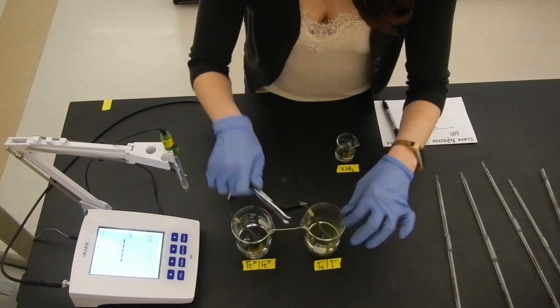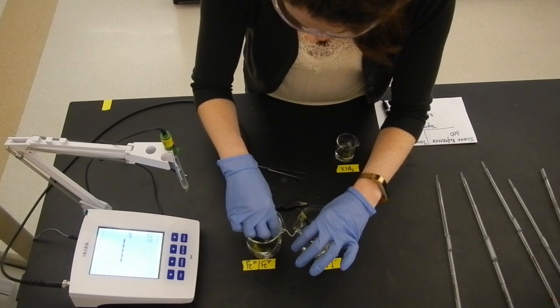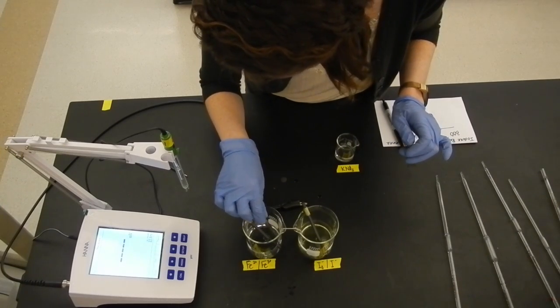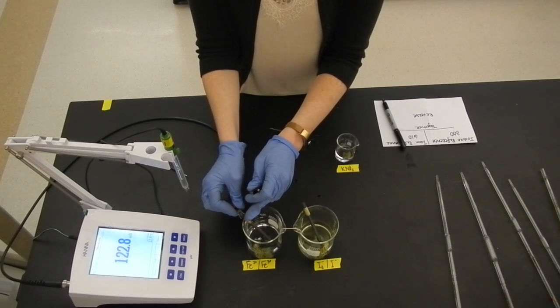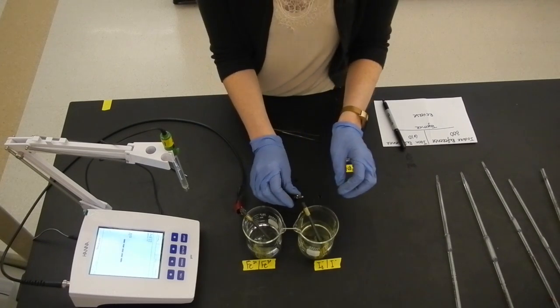This string that has been soaked in potassium nitrate will serve as the salt bridge by submerging one end of the string in the iron reaction beaker and the other end in the iodine reaction beaker. Once the salt bridge is in place, connect the two graphite rods to the voltmeter and record the millivolt reading.